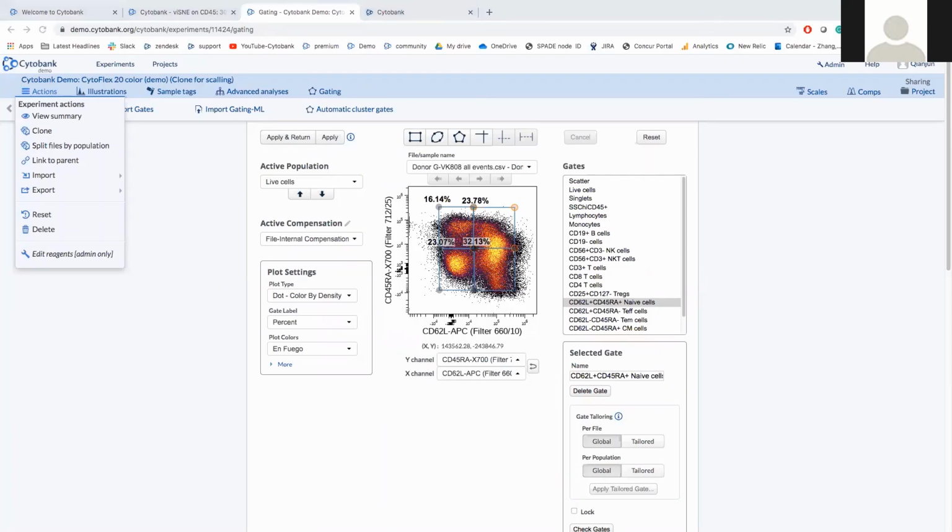Thanks. So I think the effect in the advanced analysis, like the tSNE plots that Chenjun showed, could be the same as if you were running your dead events or your debris, because those values that you're seeing in the non-compensated data don't reflect the true values that you want to be using.